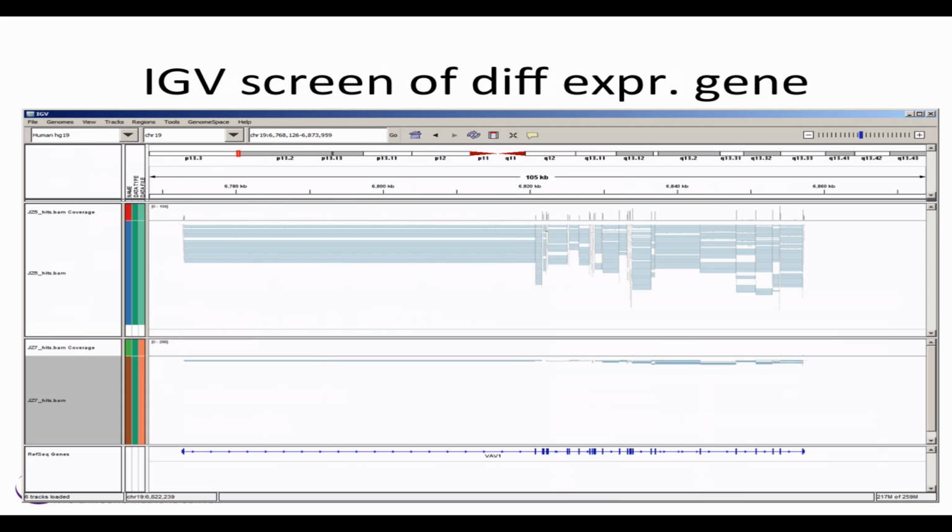It could be 100% different, meaning your sequenced sample is homozygous for a different allele than the reference genome, or it could be something in the 50-50 range, meaning that your sample is heterozygous, or you may see something weird like 90-10, showing allele-specific expression, and you already made a discovery in your first day of genomics.